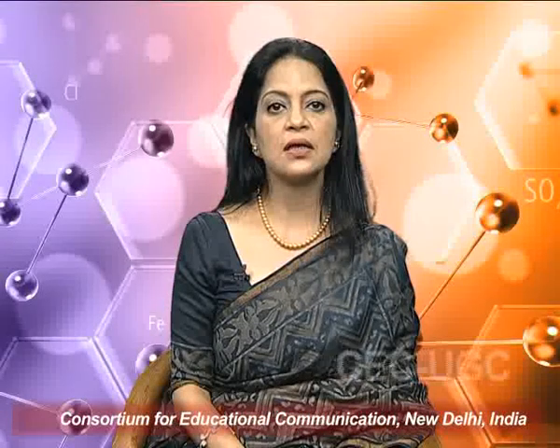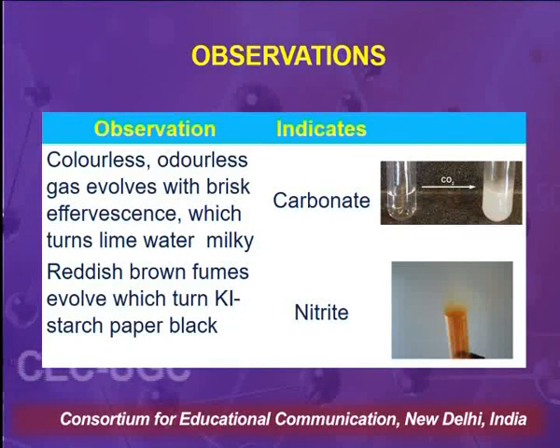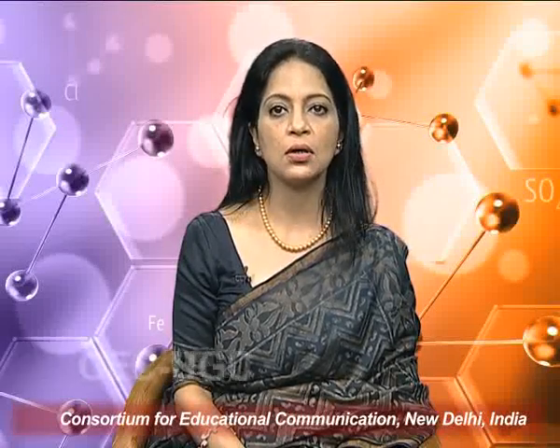If reddish brown fumes evolve which turn potassium iodide starch paper black, that means a paper dipped in a solution of potassium iodide and starch is put on the mouth of a test tube from which the gas is being evolved, and that paper turns black in color, that indicates the presence of nitrite ions in the mixture. The brown fumes which are evolved are seen in the picture by the side.